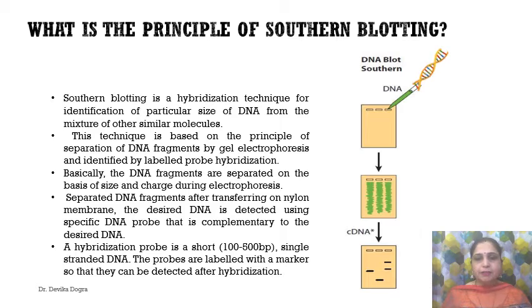This is the principle of Southern blotting method as well as its variants, and it requires the target nucleic acid sequence to undergo separation by agarose gel electrophoresis, be transferred to an appropriate membrane, mainly nitrocellulose membrane, and then be treated with a solution containing the labeled probe that will be fluorescent or colorimetric.